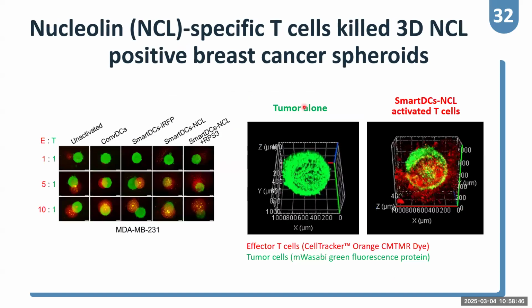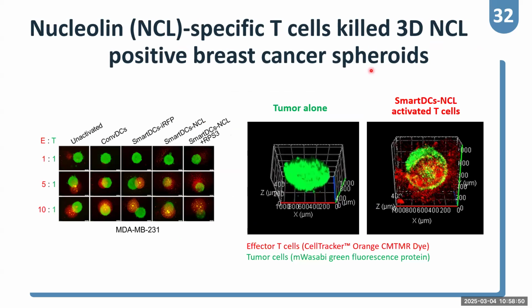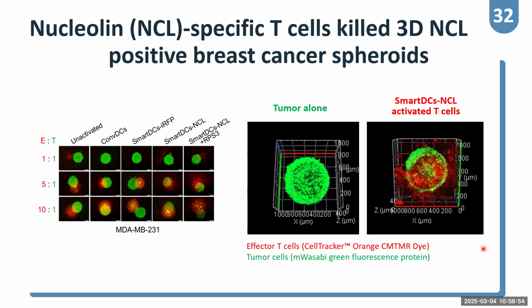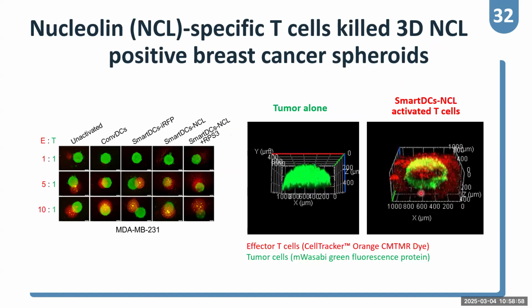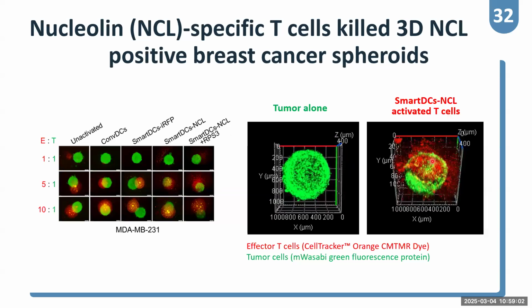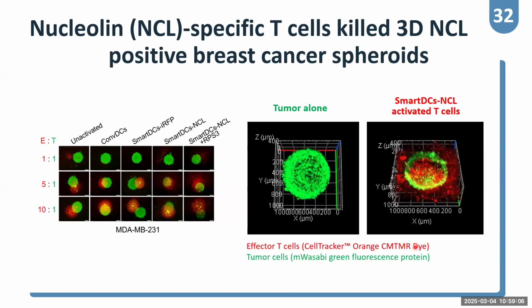Okay, and again, we can use the 3D structure, 3D model, to test the T cell function. And I show to you the T cell can invade and destroy the 3D structure when the T cell has a specific target on the 3D model that we form.